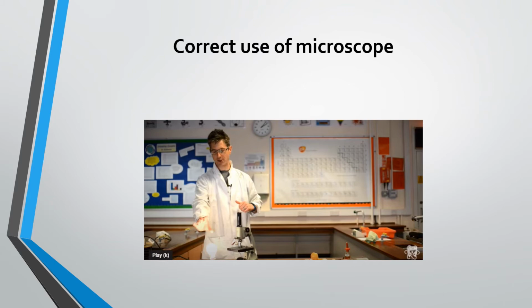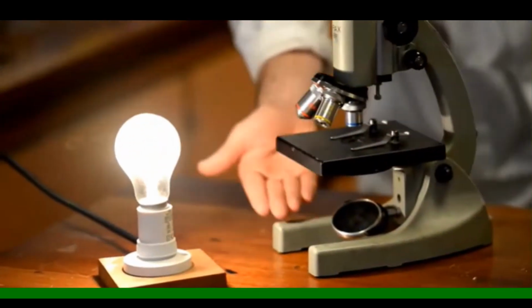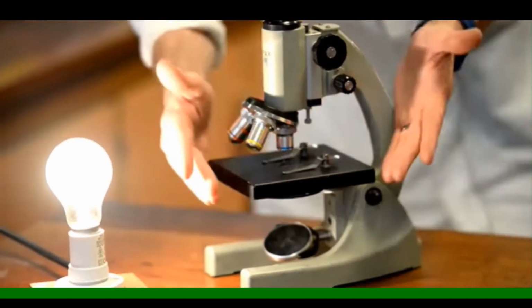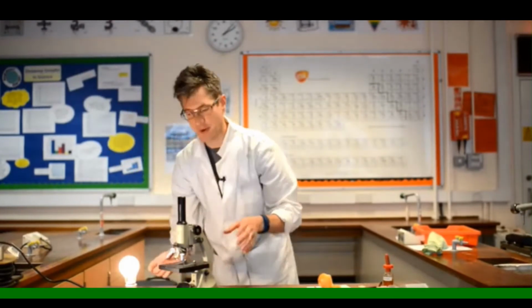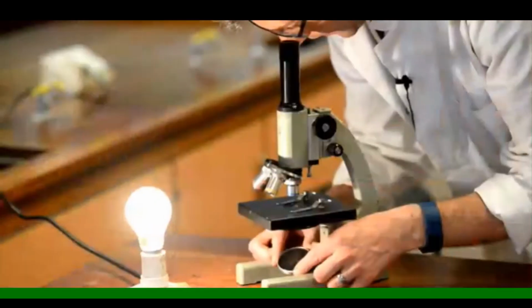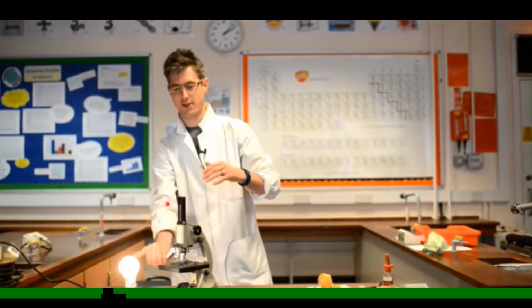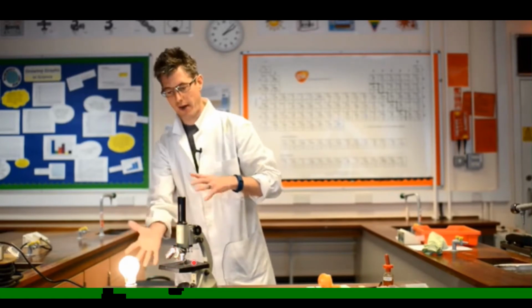So I have attached a video which is copied from YouTube, and let's see how we can use this microscope to observe a specimen. So the first thing is you have to keep this microscope on a flat surface. It is a must. And after keeping it on a flat surface, you can adjust the mirror and the diaphragm to get a clear spot of light onto the stage. And you have to keep your eye on the eyepiece to observe whether a clear spot of light is falling on the stage.